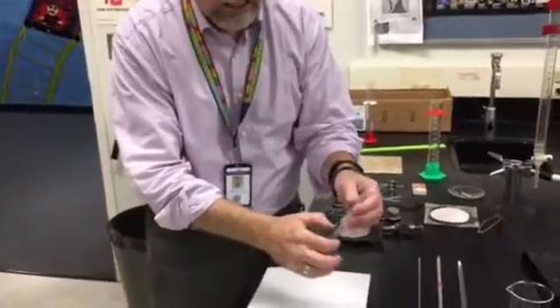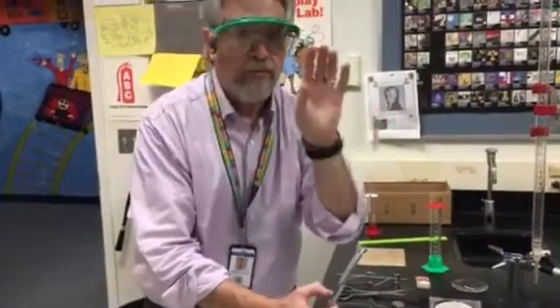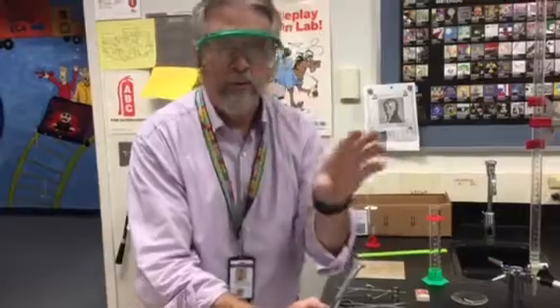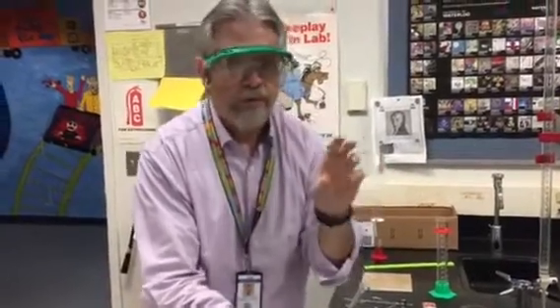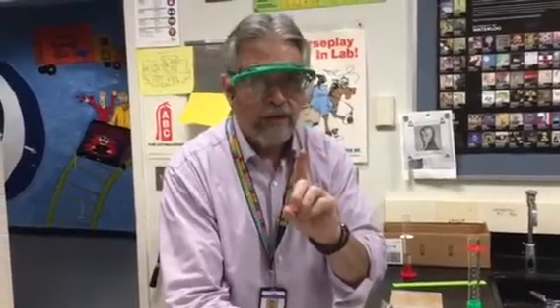The hardest thing we can give you for a measurement is when it is exactly on the line. If it's exactly on the 5, as chemistry teachers we'll see the answer 5 milliliters, 5.0 milliliters, 5.00 milliliters, 5.000 milliliters. Only one of those is correct. In a math class, 5 is 5 is 5 is 5. But 5 is not the same in a chemistry class.